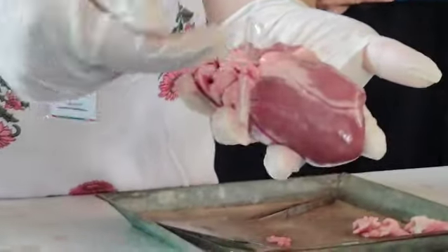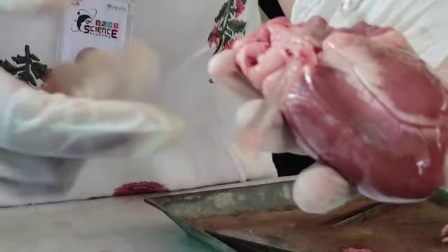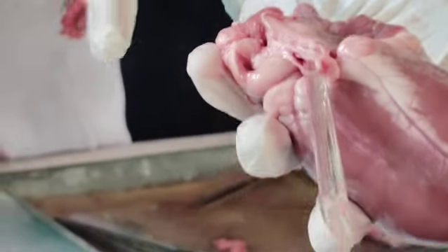Sorry. Coming from the bottom, this is the inferior vena cava. Coming from the top is the superior vena cava. Okay.